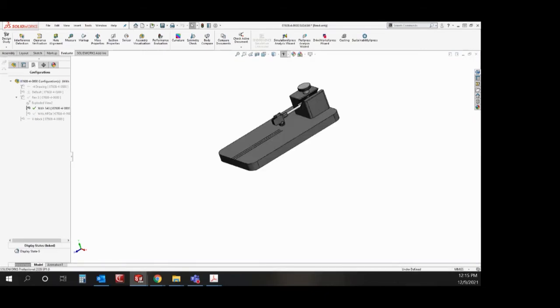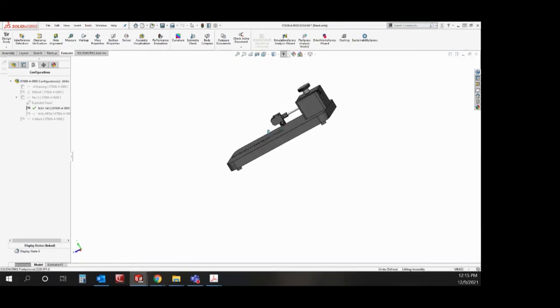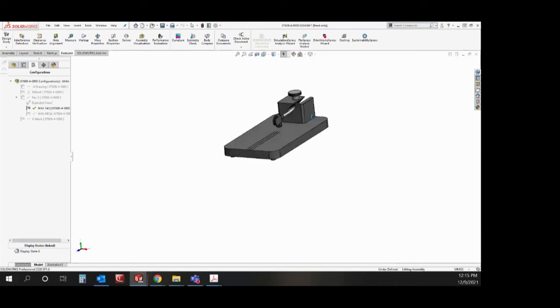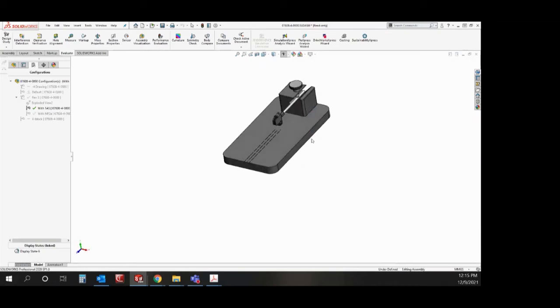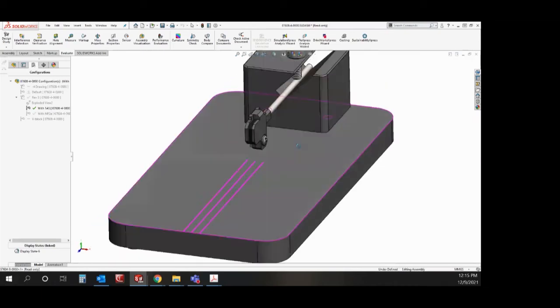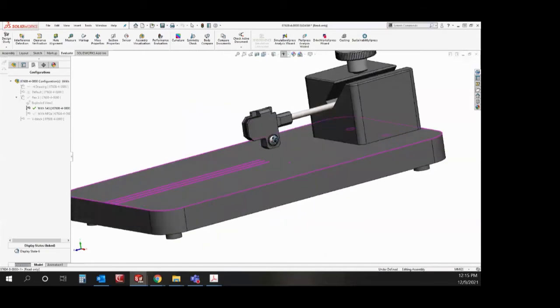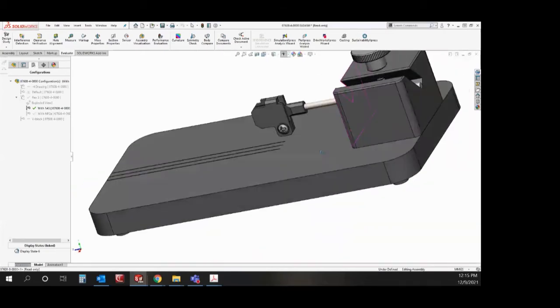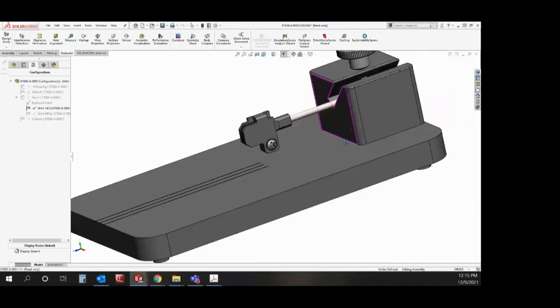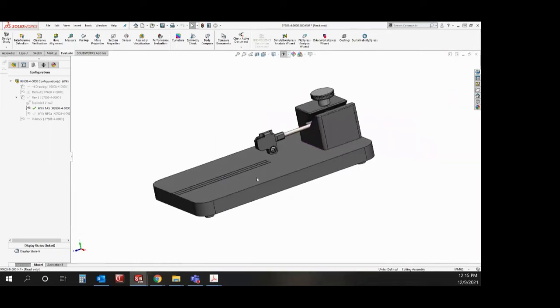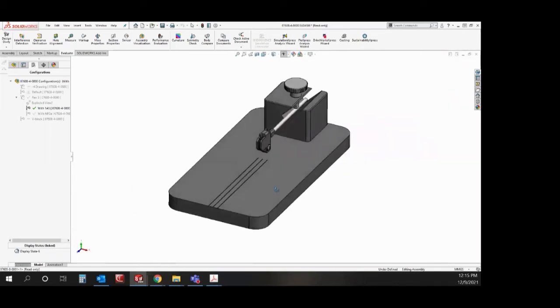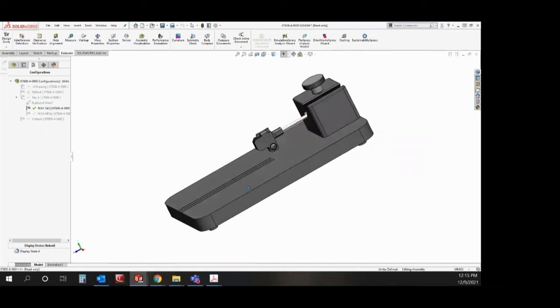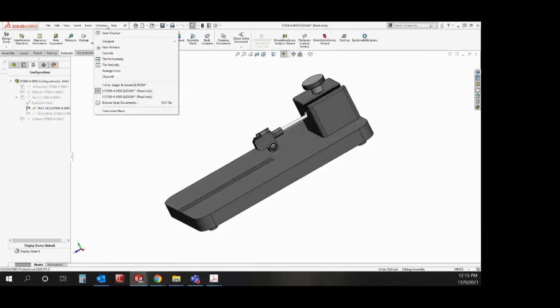The alignment fixture is also compatible for those of you that have 1A slim probe mounts. We understand there are some trouble with getting those shanks aligned as well. So if you have a 1A slim probe mount, you could also use this fixture for that purpose. You can rotate 360 degrees for checking multiple directions.